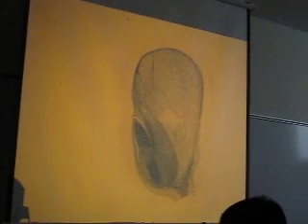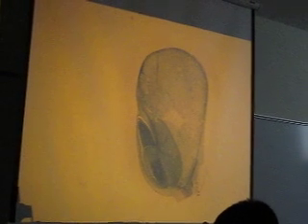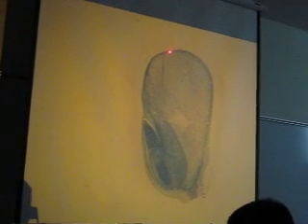Okay, then finally the last slide. This was not under a microscope. I just got real close to my camera and took the picture of your slide. Pericarp and seed coat. This is all endosperm of the corn grain. Scutellum, or cotyledon, and growing embryonic axis.